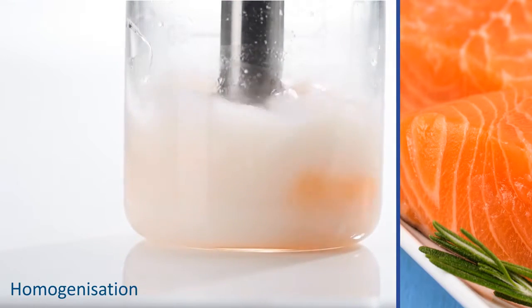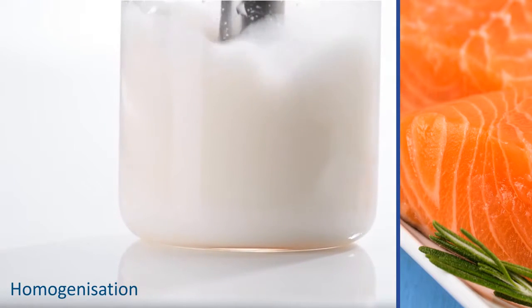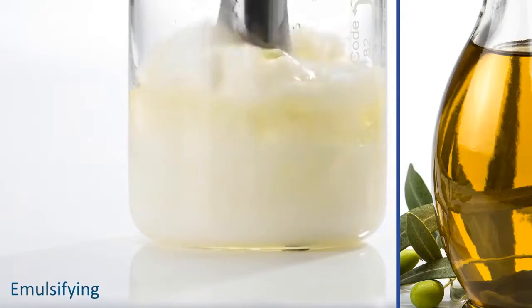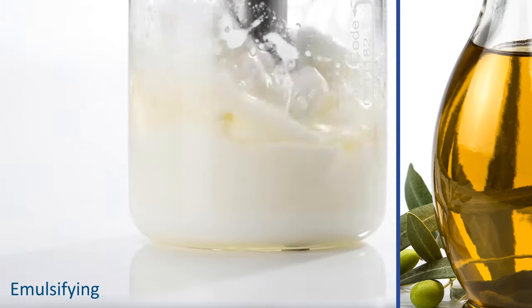On this point, the ultrasonic method is demonstrably better than conventional methods are. Best of all, it is perfectly compatible with certified processors. Sonopulse devices are distinguished by the long-term stability of the emulsions they generate, with droplet sizes down to the nanometer range.